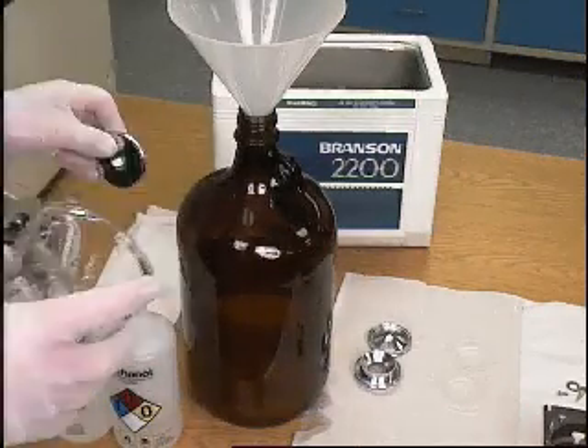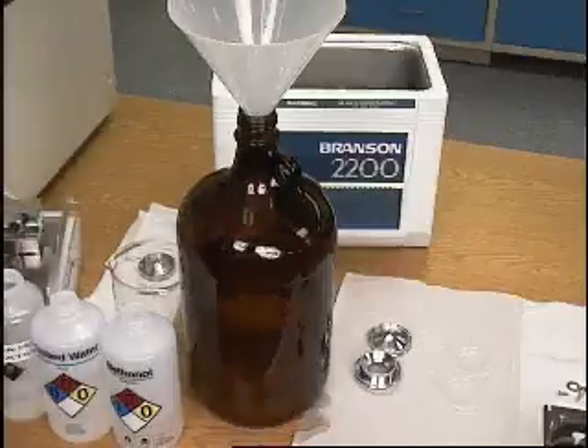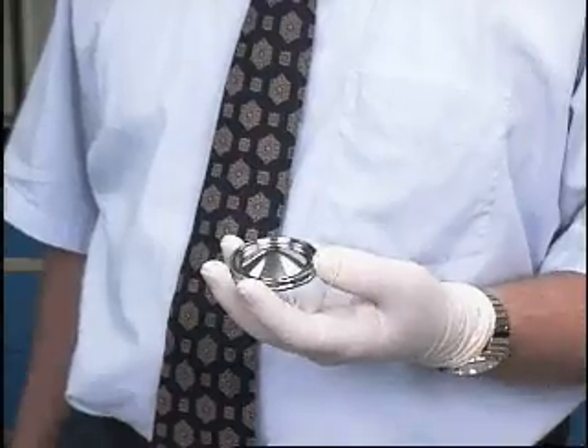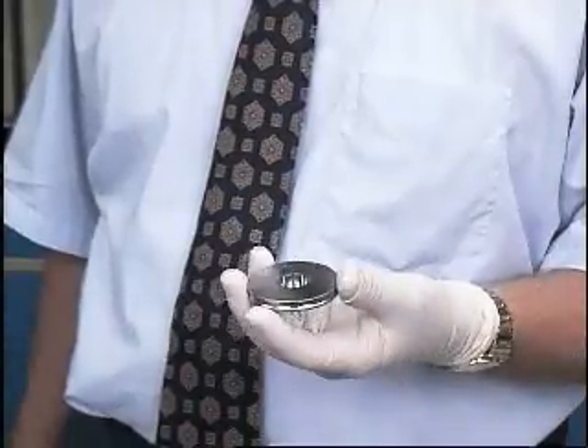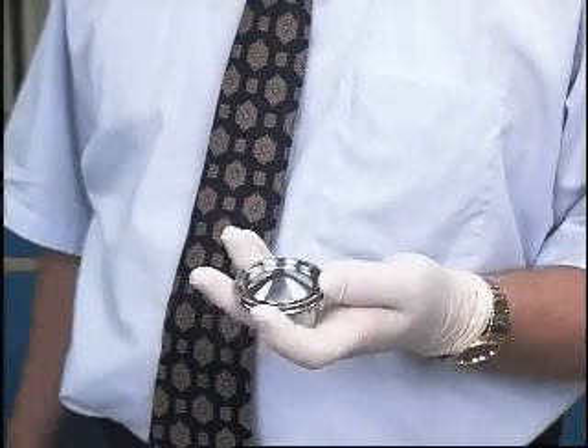Remove the ion trap parts from the beaker and place them on a clean, lint-free surface. Allow the parts to dry in air. Inspect each part to make sure that all spots and particles have been removed. If you observe any contamination, clean the part again using the procedure described previously.